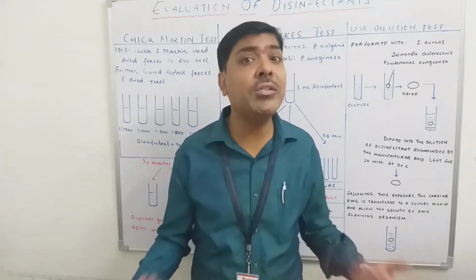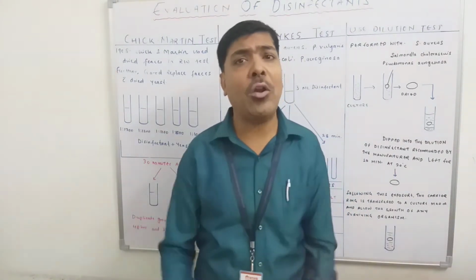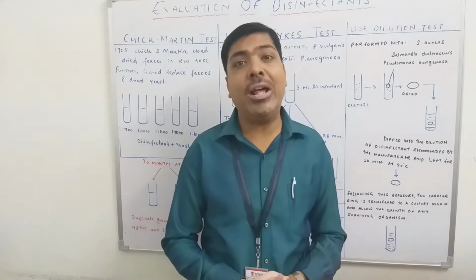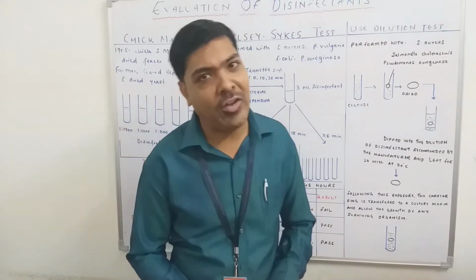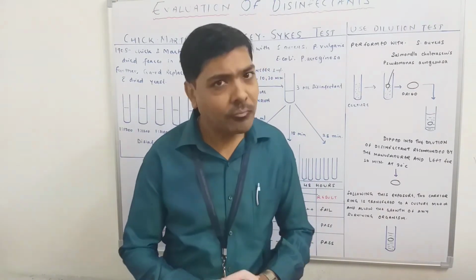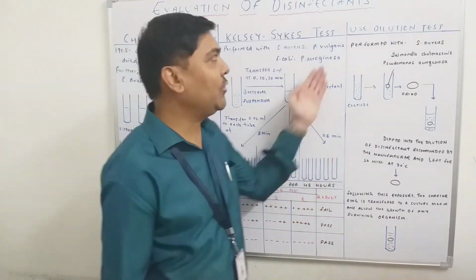Before using this particular disinfectant on a very large scale in any hospital or pharmaceutical industry, we first need to check whether the dilution claimed by the manufacturer is correct or not. That is the basis of the use dilution test. Now, how do we perform this use dilution test?